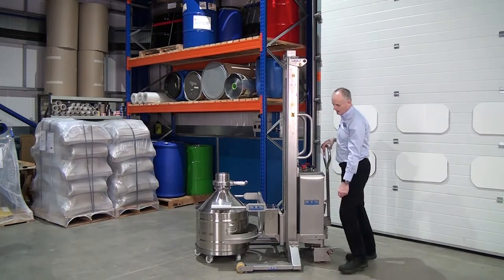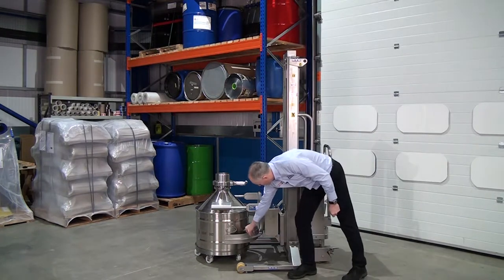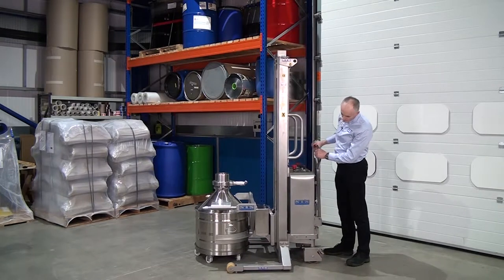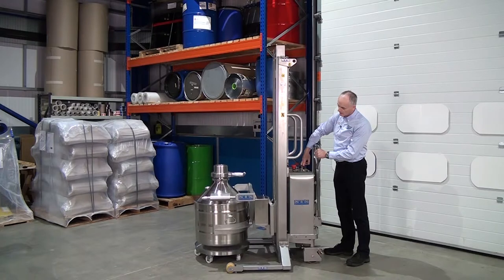Again watch the back band here. So this band — push it forward, so that's all the way into the drum. Keep it pushed forward slightly when we lift.